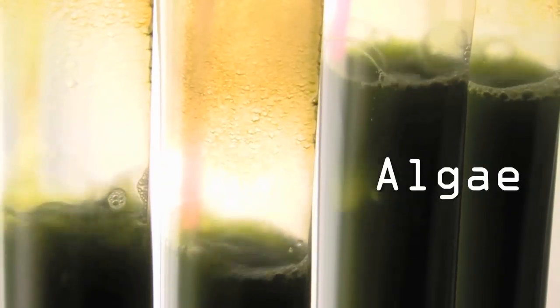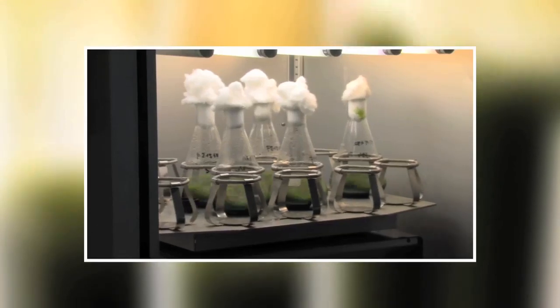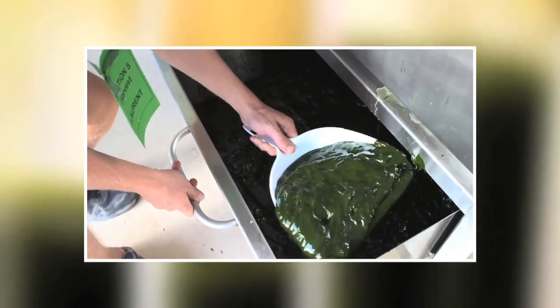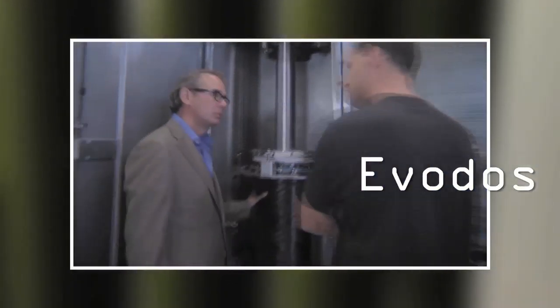Algae are used more and more for research and for industrial purposes. To get them out of the water always has been a challenge. With Evodos, you can overcome this hurdle.